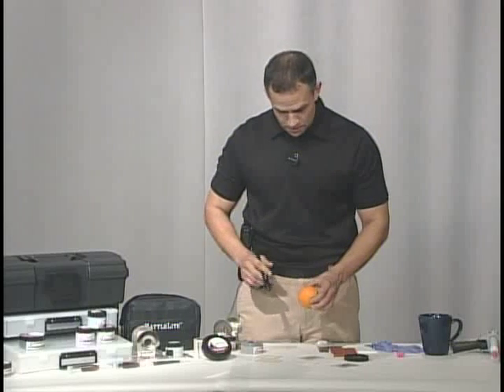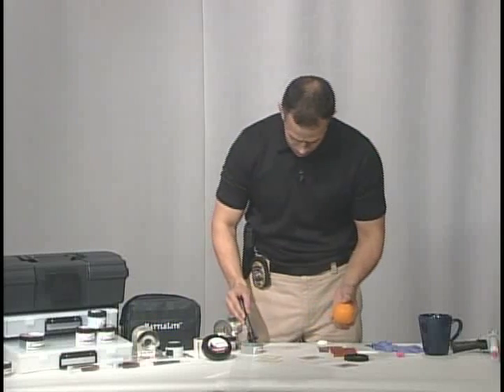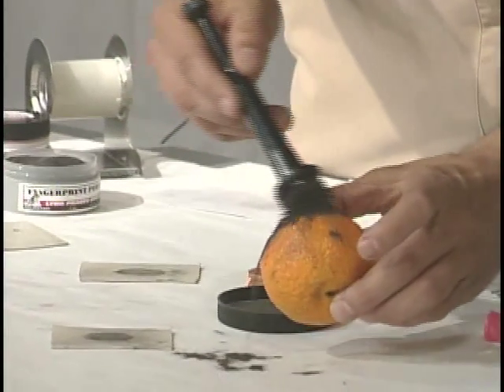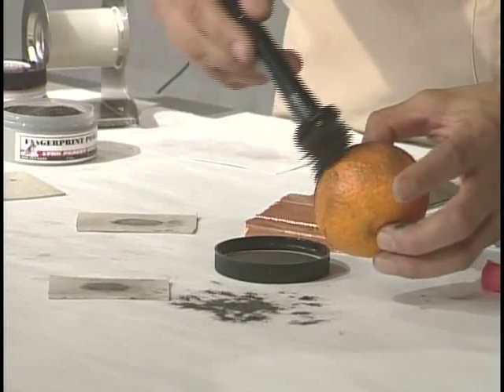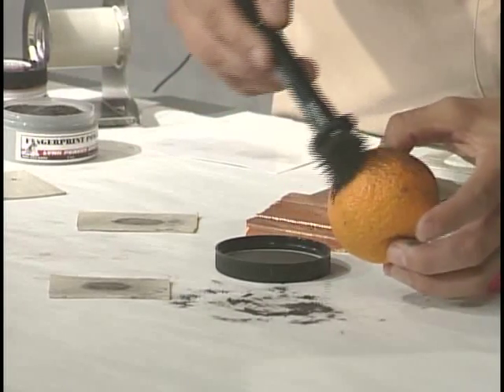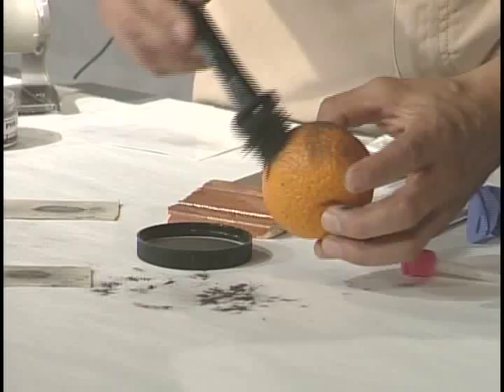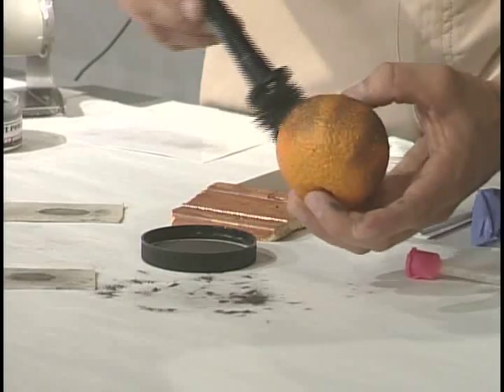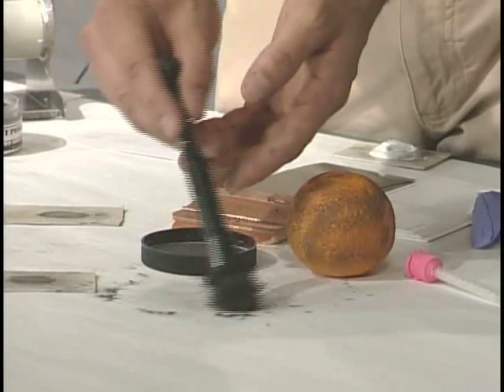Now we're going to try to develop a print on an orange. It's a textured surface — there's lots of grooves in it. We're going to try with our magnetic powder. We've processed our orange, and I'm going to go back and clean up.